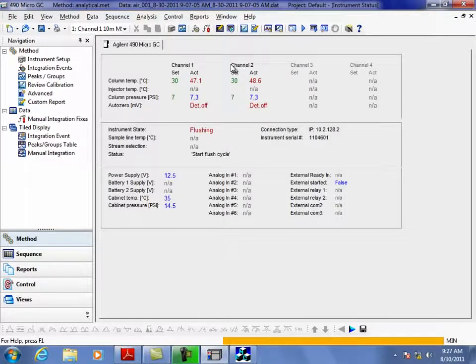When you're talking about the syringe, you're going to explain later on how we'll go about that process. I'm wondering why you want to do a syringe. To me, a micro GC is a gas analyzer. By definition, you can't shoot anything but vapors in it. You'd have to have a gas-tight syringe with a valve on it. Most times gases are a little bit pressured, and if they're not, I've got a pump to pull it in.